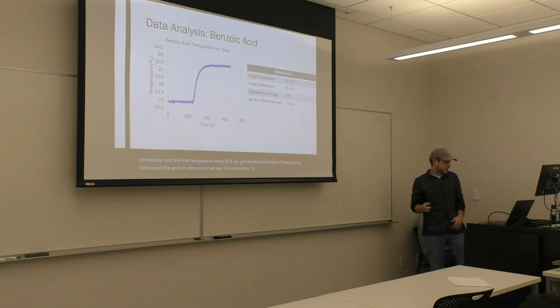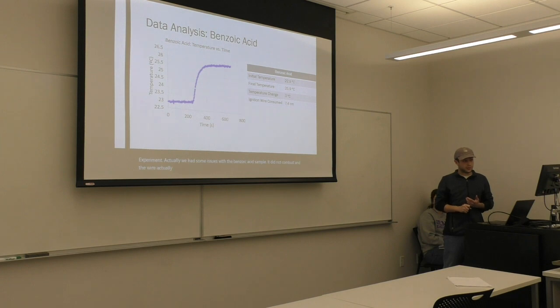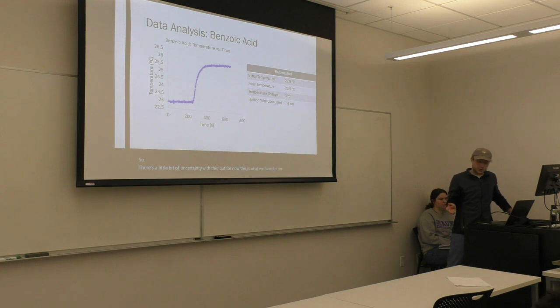So in this experiment, actually, we had some issues with the benzoic acid sample. It did not combust, and the wire actually fused to the sample itself. So this data was provided by a different lab group. So there's a little bit of uncertainty with this, but for now, this is what we have for the benzoic acid sample.